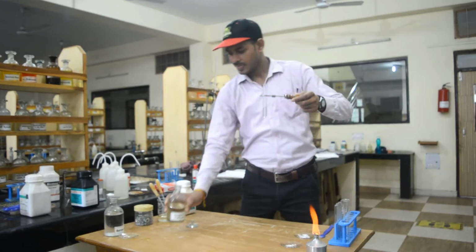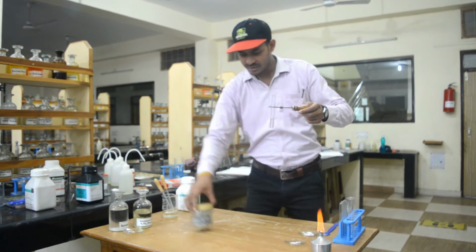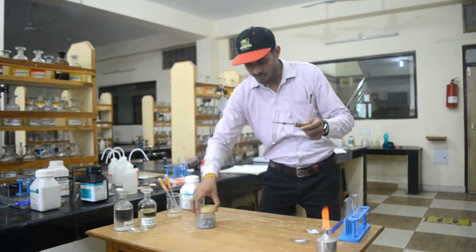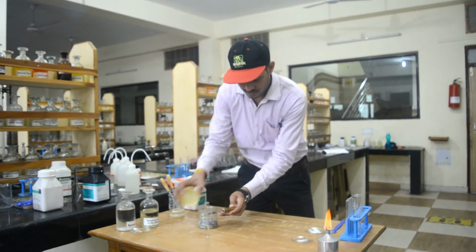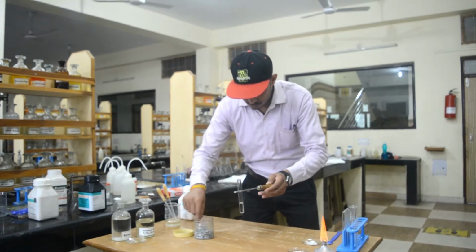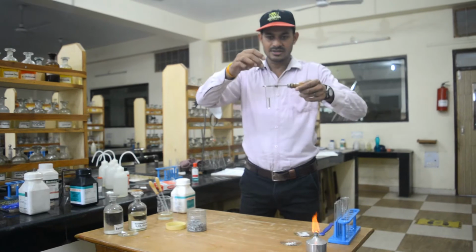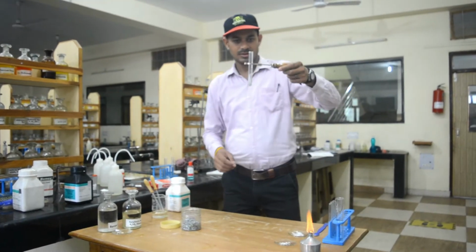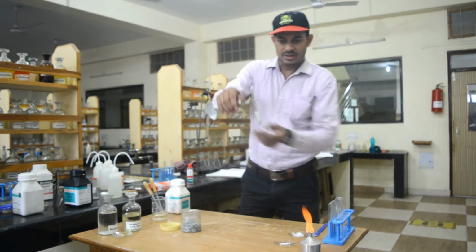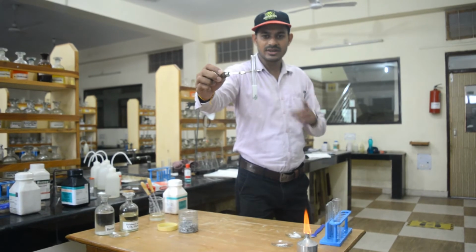Now I have taken the sulfuric acid in this. Now I will take a zinc granule, which will react with the sulfuric acid. Let us see what we observe. A small piece I will keep in this. Now you can observe that the reaction is taking place. Zinc is reacting with the sulfuric acid.